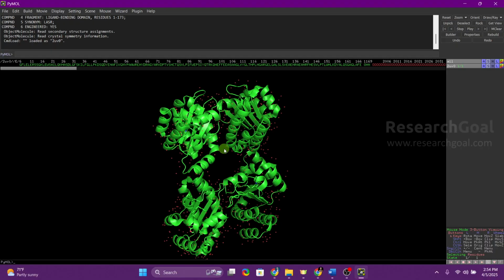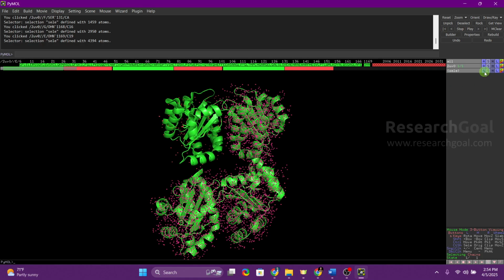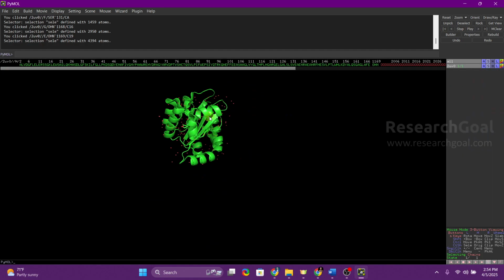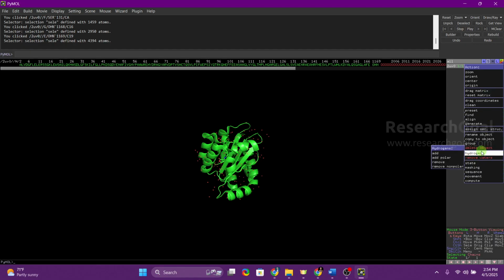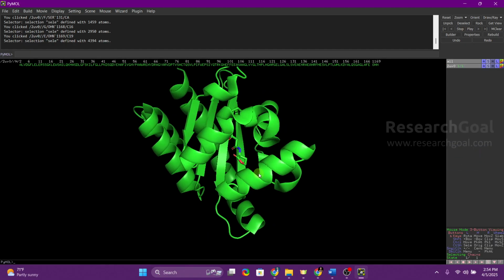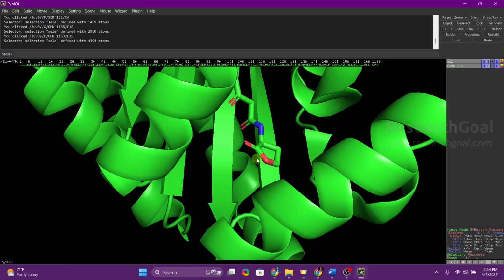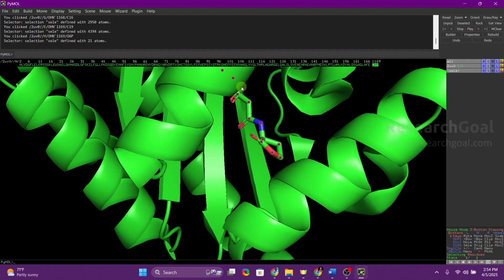You will go to the Sequence tab, then to selecting chains, and delete all the chains that you have previously deleted, remove atoms, and also remove water molecules. In this case, now we have to remove the ligand molecule. So we'll go to the residues. Remember that, because only then can you select the ligand molecule. So you zoom in and select only the ligand molecule.